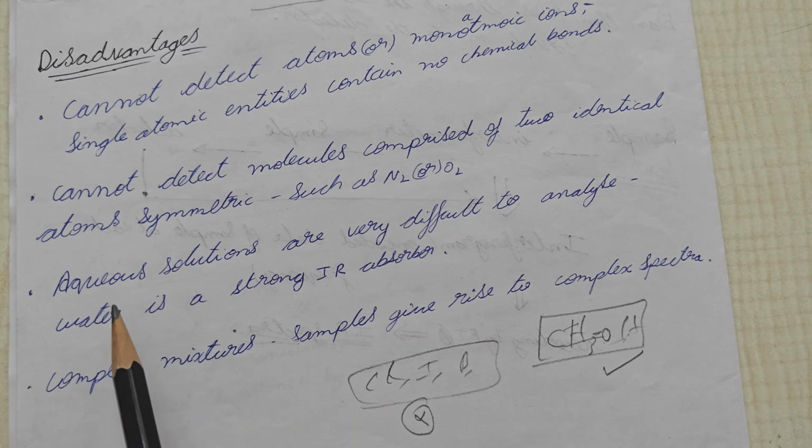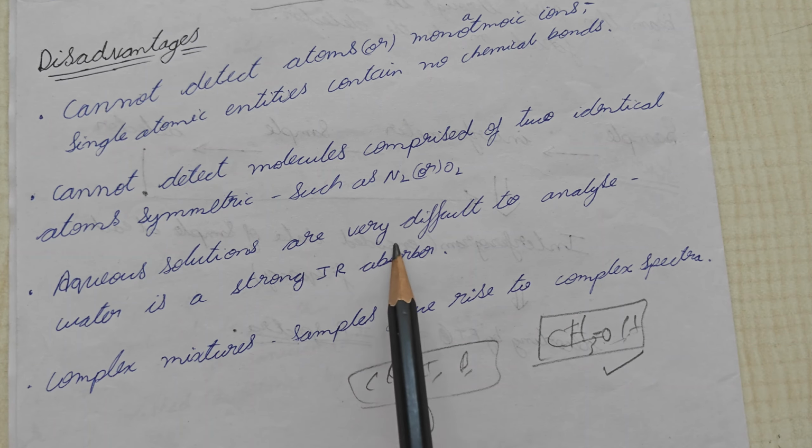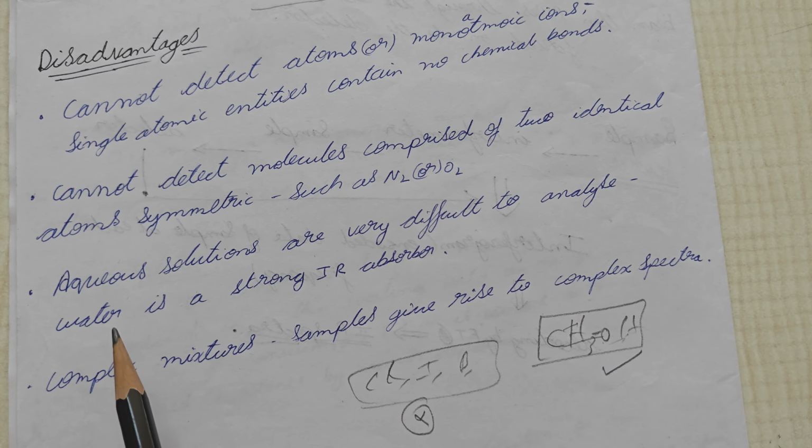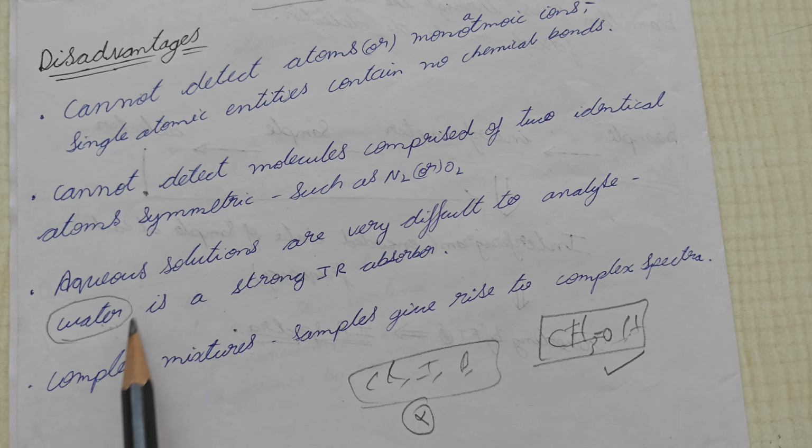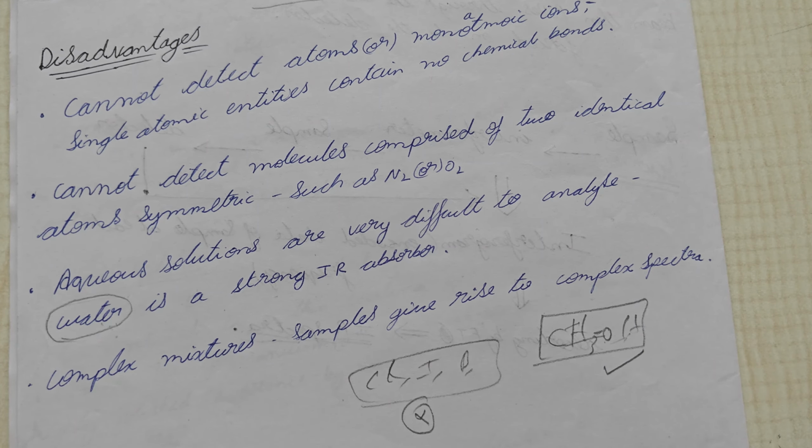Aqueous solutions are very difficult to analyze. Water is a strong IR absorber. This is a very good point: the reason we don't use water as a solvent is that water absorbs the IR radiation, so aqueous solutions cannot be used.